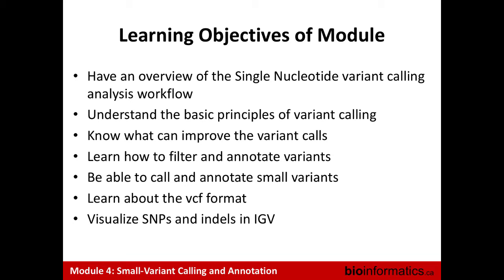So we will revisit this part, plus other parts on when we can also use other methodology to improve the variant calling. We'll see how to filter and annotate the variants, and we will also learn about the VCF format and a bit of visualization, but you already saw it yesterday with IGV.